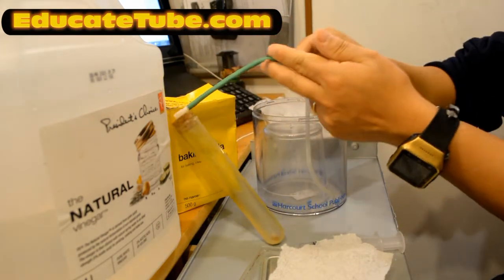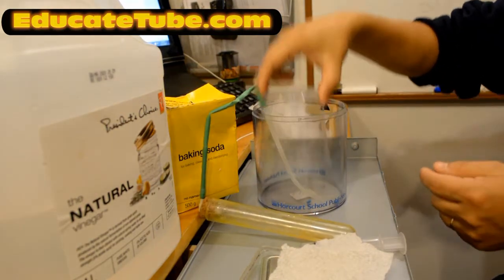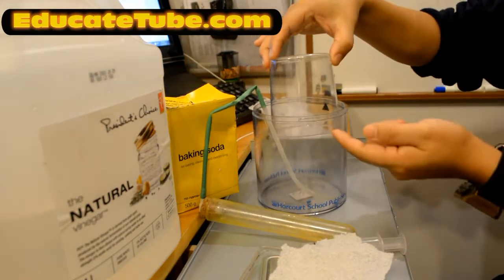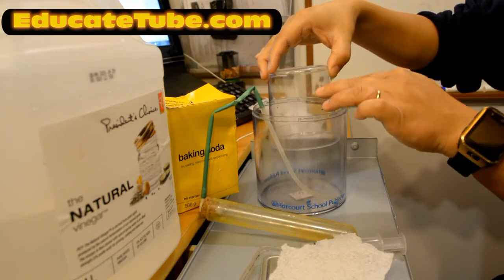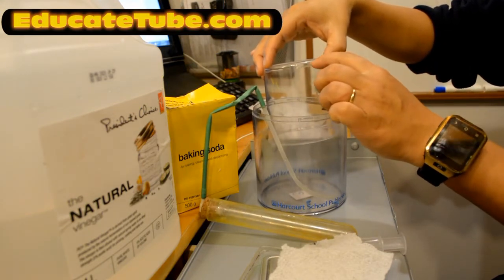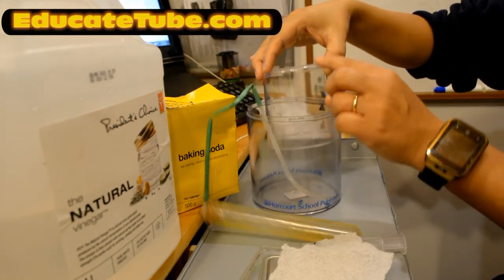The carbon dioxide will bubble through into this chamber, which is filled with water. The gas will then displace and push the water downwards, and the amount of gas that's inside this container is equal to the gas produced, right? You get this amount of gas.